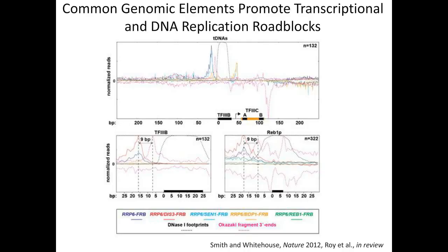And we thought perhaps this is a characteristic signature of these different modes of roadblock, different modes of DNA and RNA synthesis. And so to confirm that, we looked at another DNA binding protein called Reb1 that also blocks these synthesis modes. And we saw the same distance of 9 base pairs from the nuclear exosome targeted poly-A tail to the Okazaki fragment 3' end.